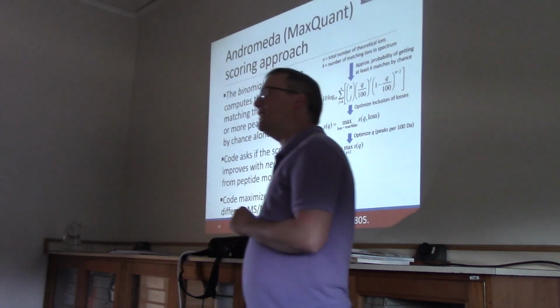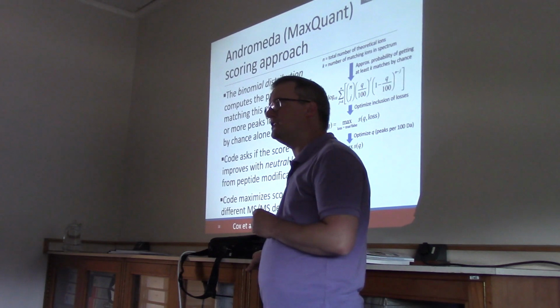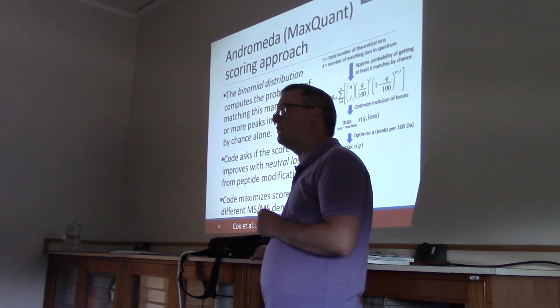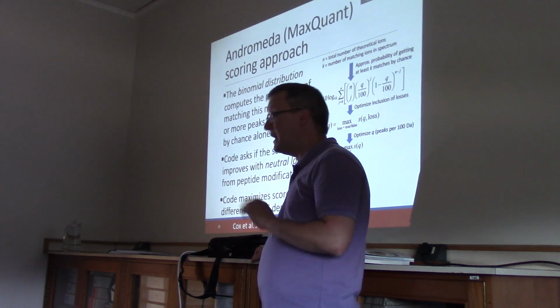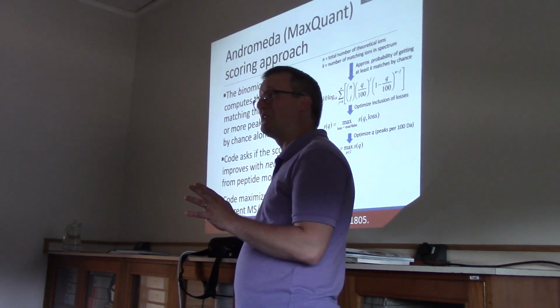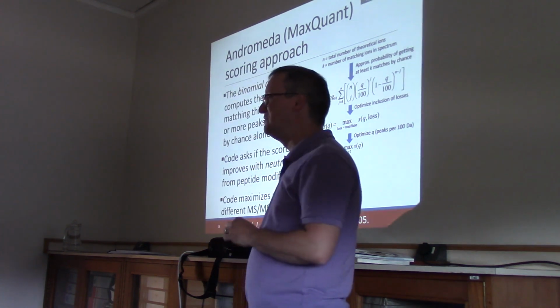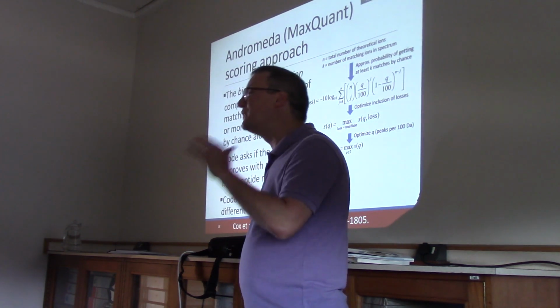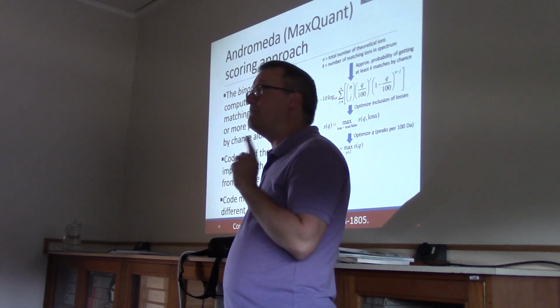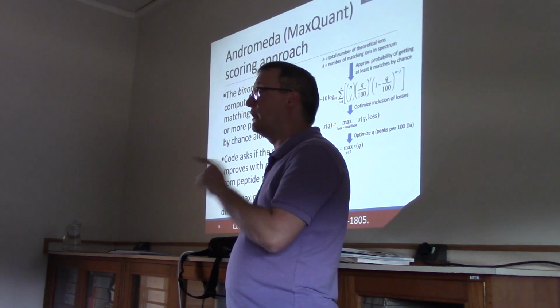Now, if you spend any amount of time over in the Blackburn lab over at UCT, you are probably going to encounter someone talking about their MaxQuant search results. MaxQuant is not my favorite search engine, I have to say. I have a bit of a bone to pick with some of the approaches they've chosen, but my feelings don't really come into this. This is a good example of a match counter scoring approach.